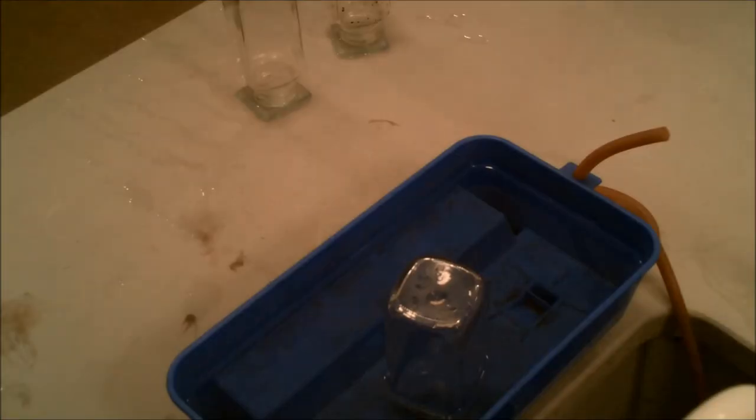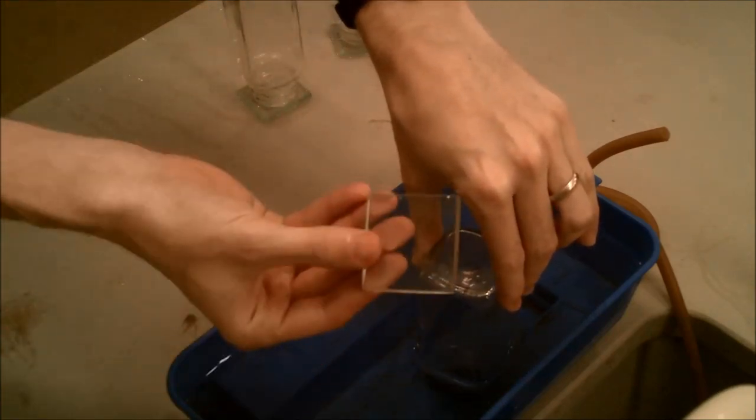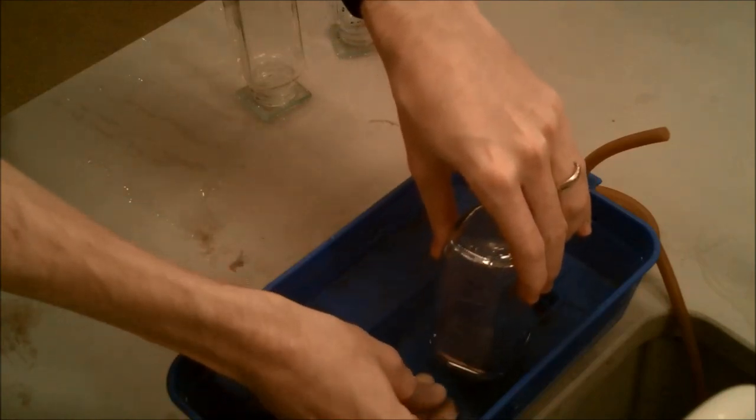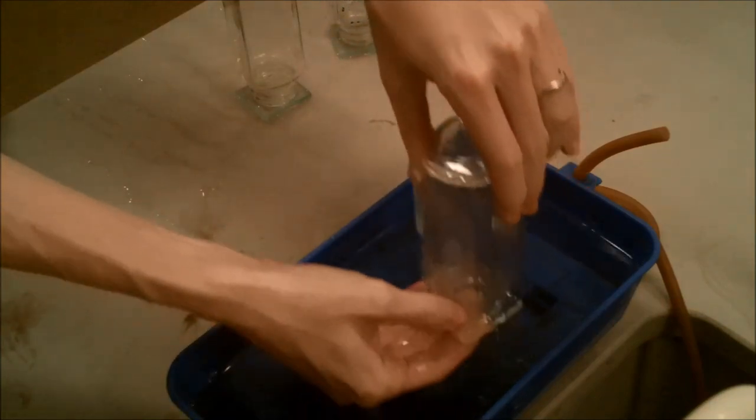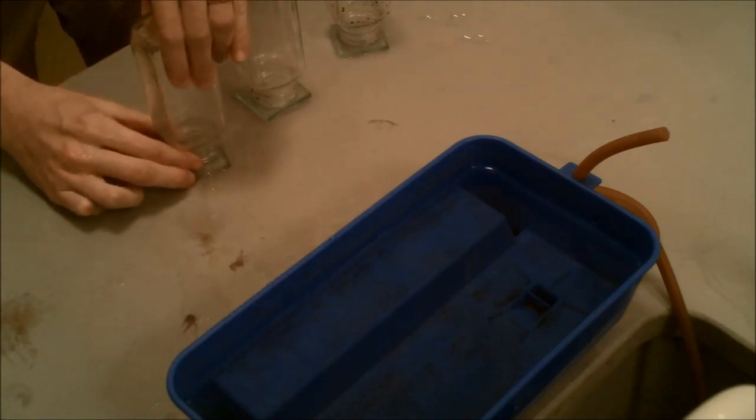Now we're to the part of the procedure where we remove the jars full of hydrogen gas out of the trough. You can see I've already removed two of them. This is where we use those glass squares again. So we put that underneath in the water to cover the opening so that the hydrogen gas stays in the jar. Take it out and then we just very carefully slide it onto the table so that that gas stays in a nice relatively sealed container.